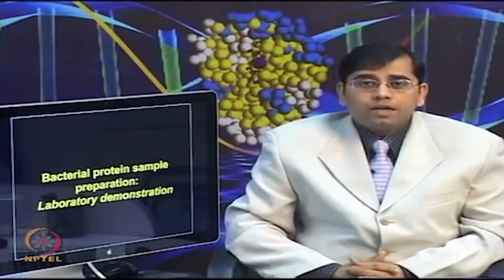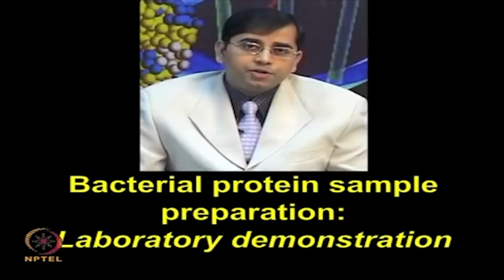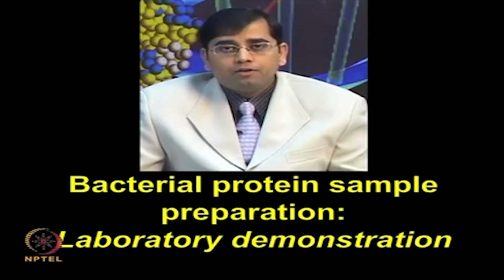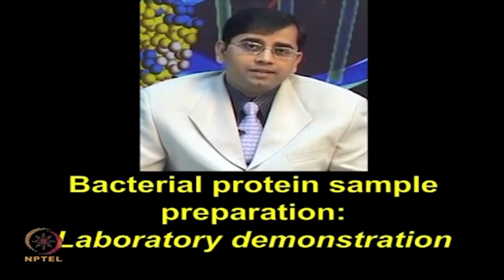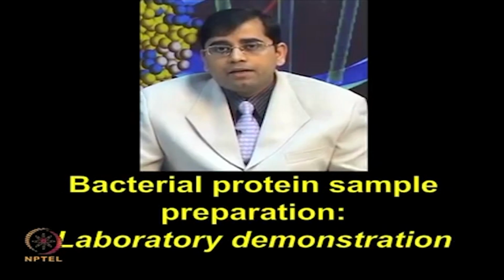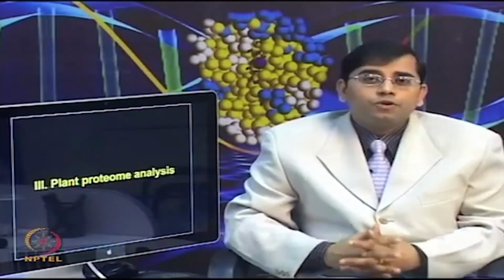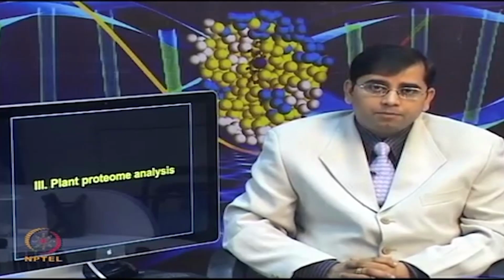Okay, so I hope this video was informative and now you are able to appreciate the complexity involved in this procedure, as well as how useful this method can be for different types of biomolecule extraction including DNA and RNA, and how protein can be rid of various types of contaminants by using the Trizol method. So, now let us move on to the plant proteome analysis, the third specific example.